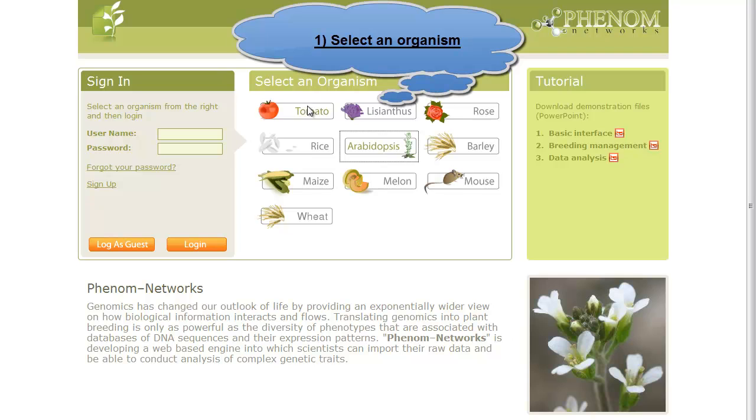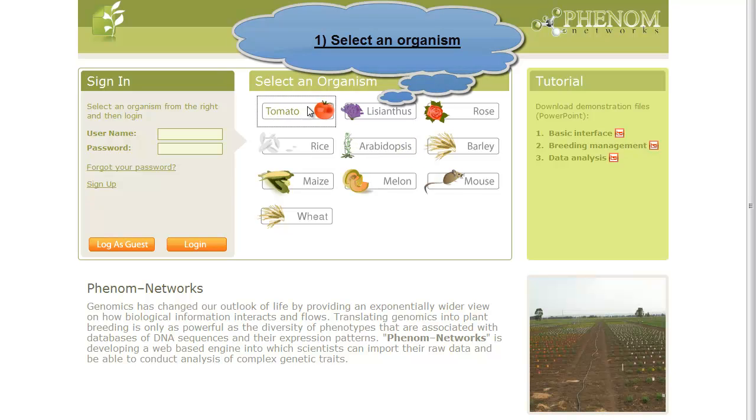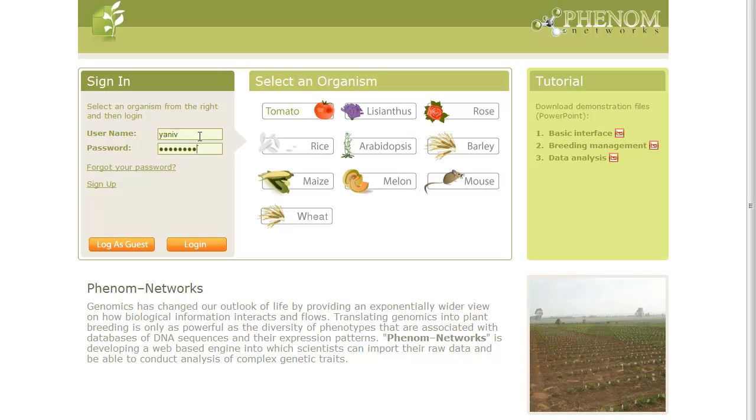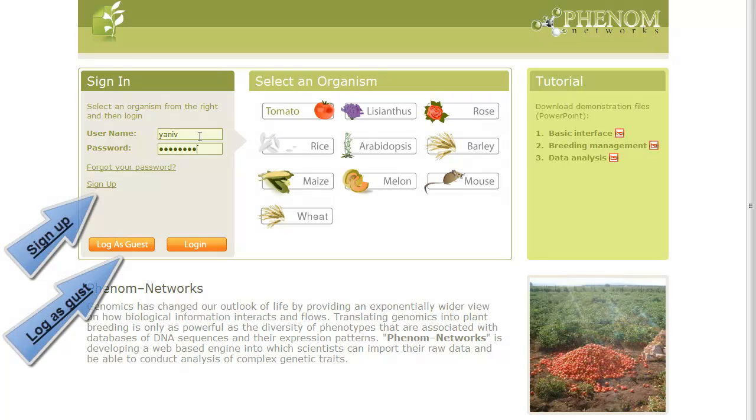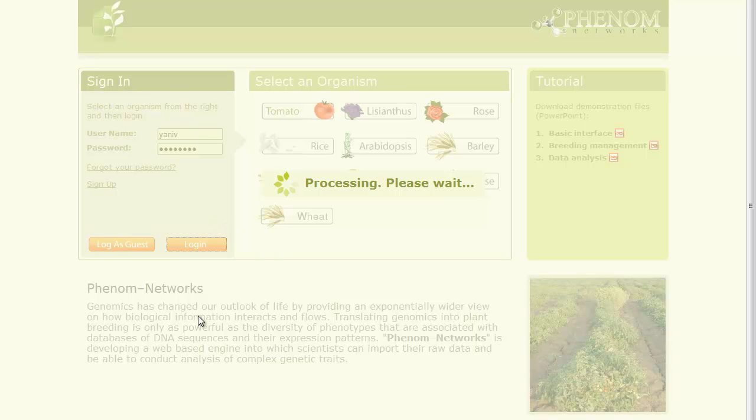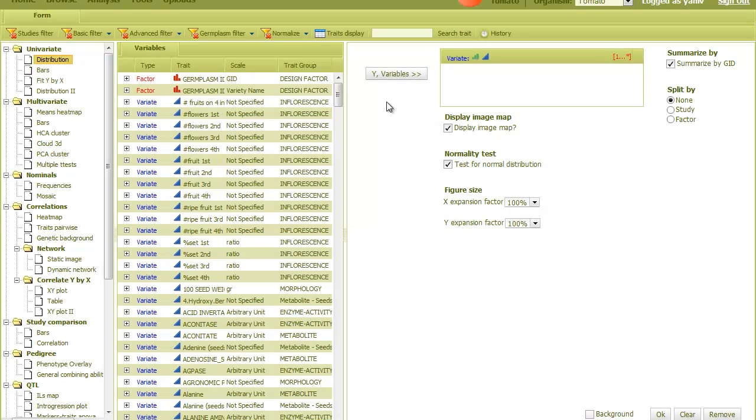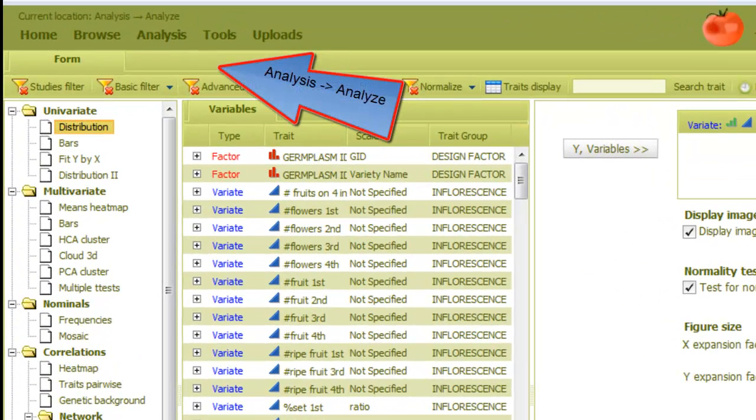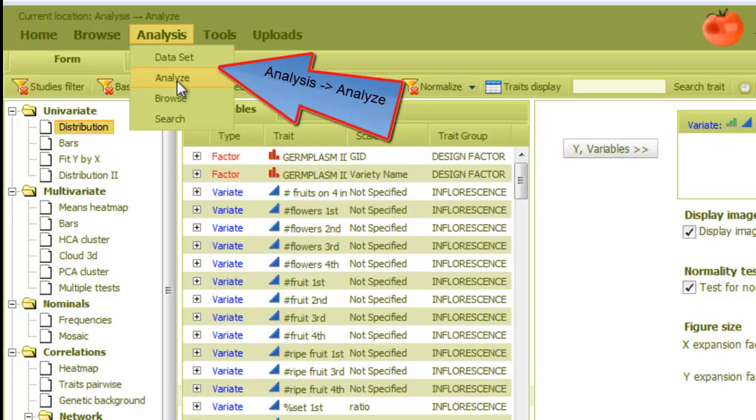To start, I'll select Tomato and then log in. Users can log in as guests or sign up to get their own account. After we log in, we are directed to the analysis page. This page can be accessed from the menu through Analysis and then Analyze.